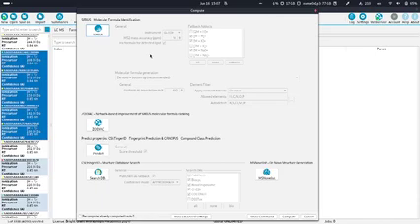Have you selected one compound or multiple? Multiple. Yeah, you should select multiple or click on the compute all. This is exactly what I meant, because Zodiac, I can show this now already.